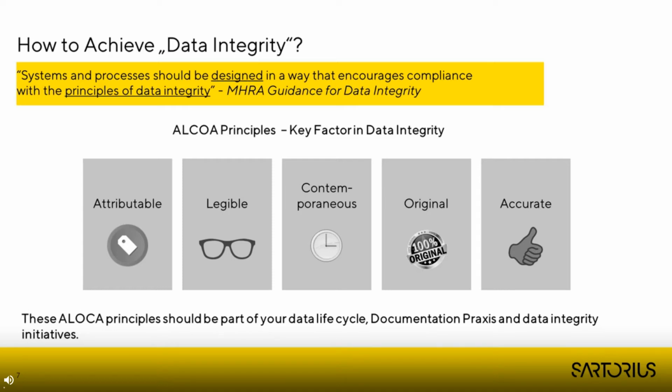Then our record or our data must be legible, or also known as traceable. That means the data is readable, understandable, and can be fully reconstructed by people who are reviewing the record. Our data must also be recorded at the time as it was generated or observed. And especially here we can see how digitalization and connected systems help, as typically in these kinds of systems, the value is stored immediately electronically by the system, and does not require a manual data transfer.